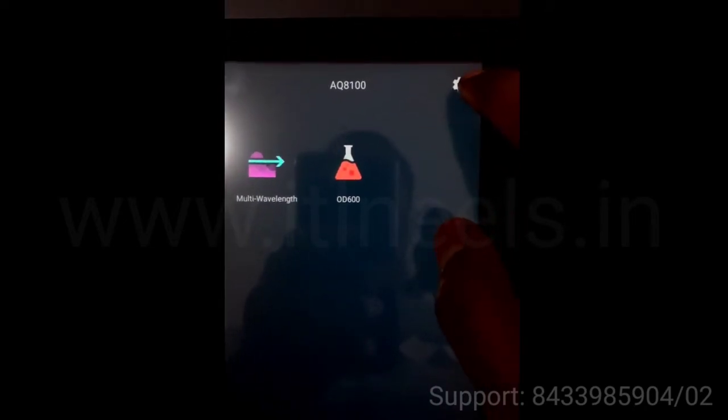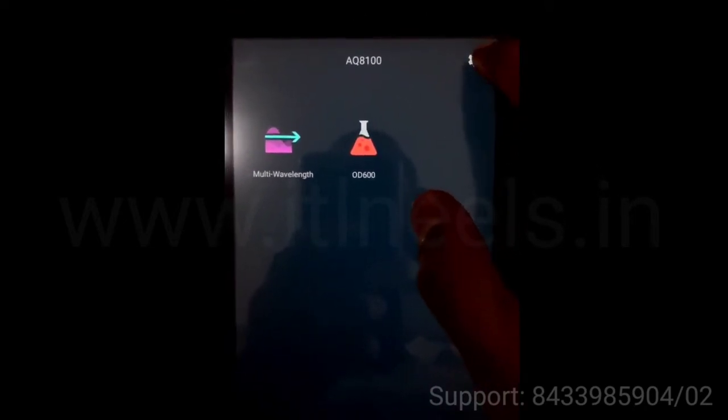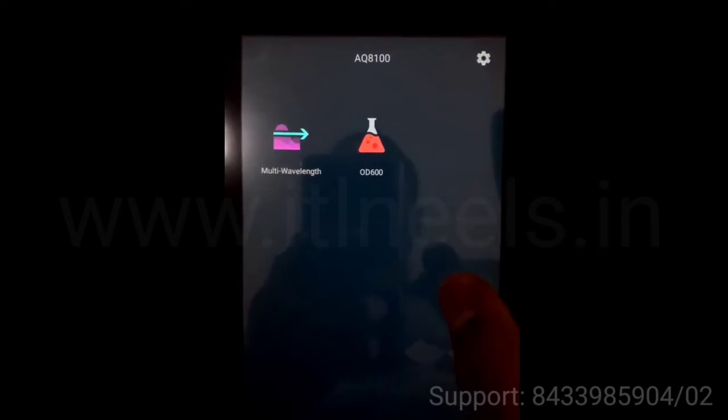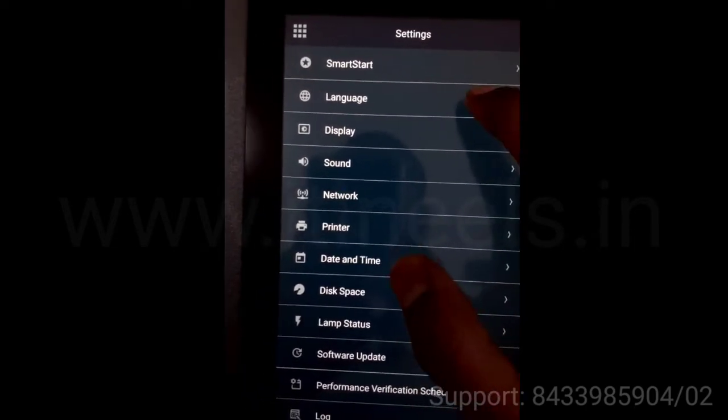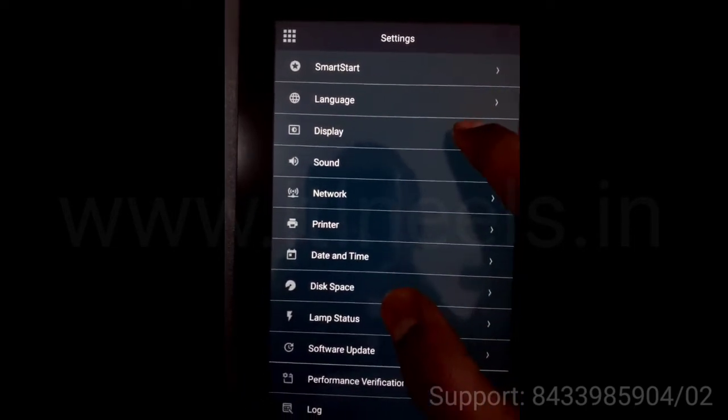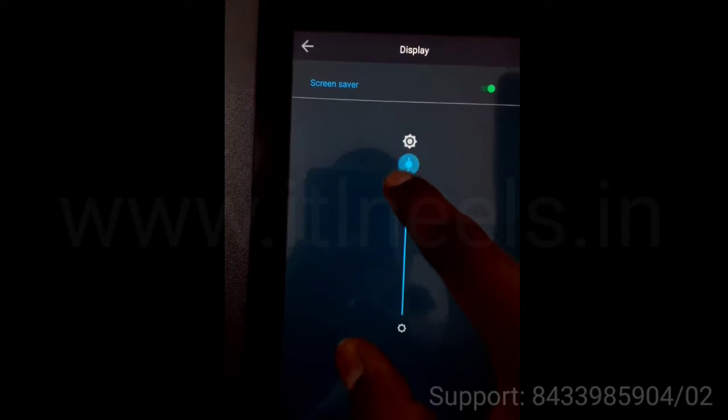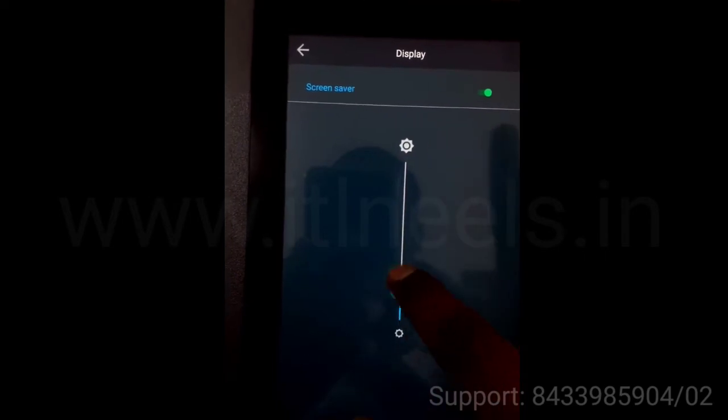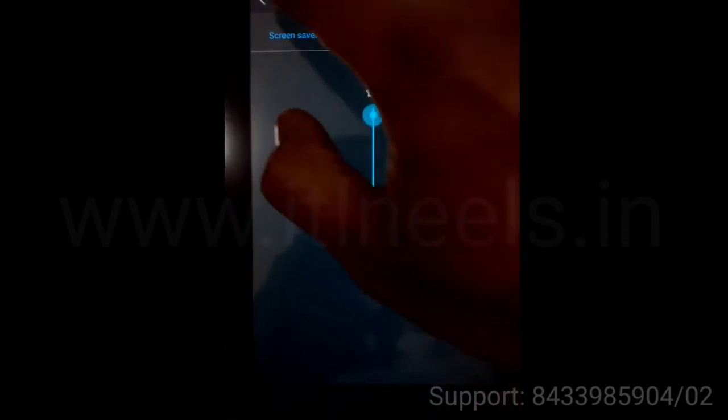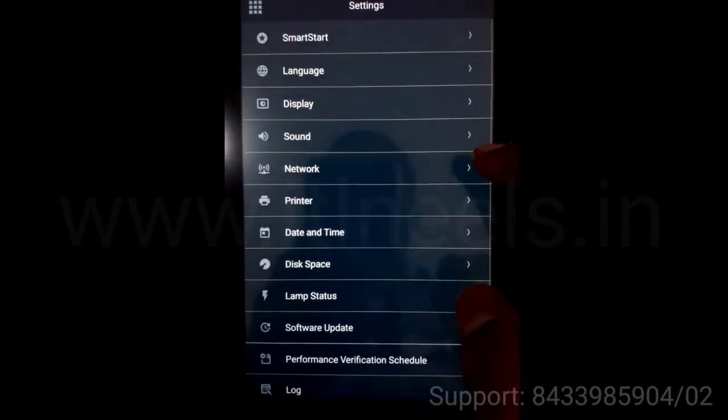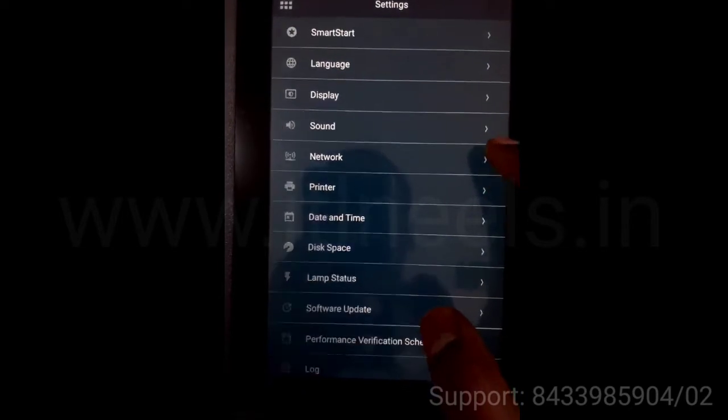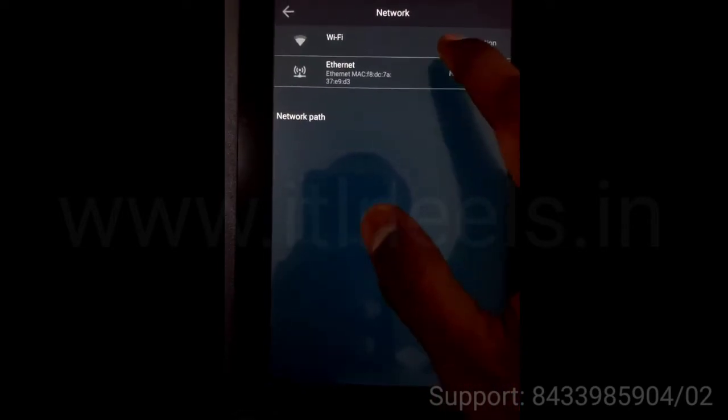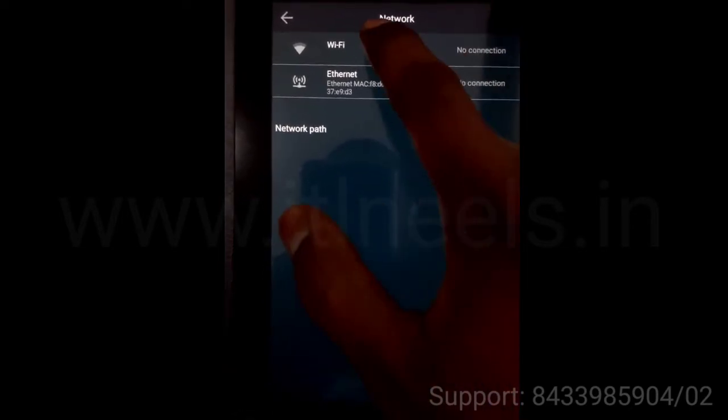This is the setup button. You can enter the setup by pressing this. You can change the language, display, decrease the brightness, sound, network. You can connect to WiFi from this.